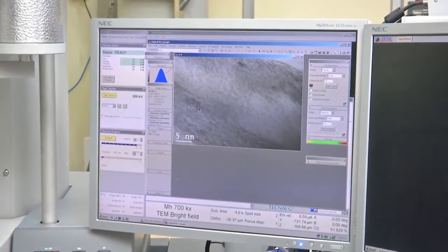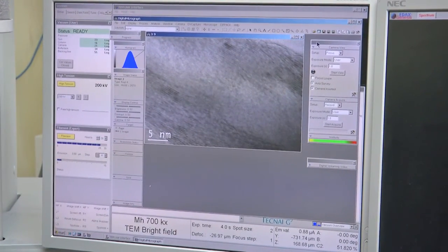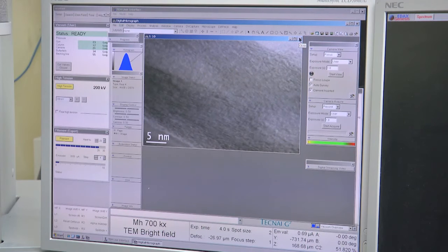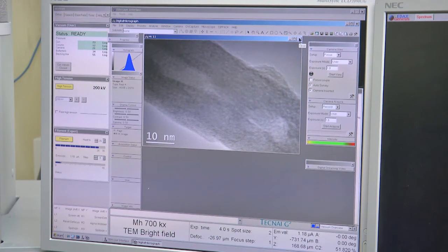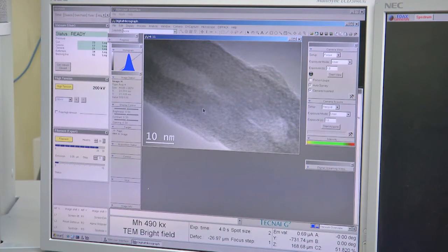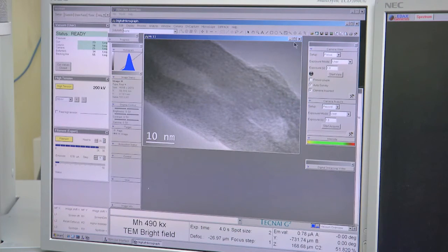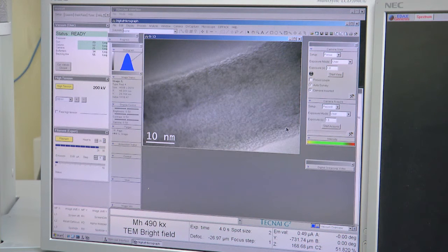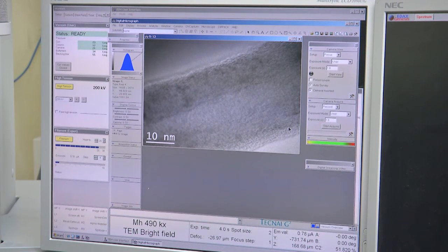This is a carbon lattice. Going to even higher magnification, then coming back down — this is slightly lower magnification at 490 kx, meaning the scale bar is 10 nanometers. This is the lattice imaging. This is the advantage of the 200 kV transmission electron microscope. Even at 300 kV you can get resolution at the 0.1 nanometer level. With a field emission gun, atomic resolution is possible. Now I am going to show you some photographs already taken with different samples.